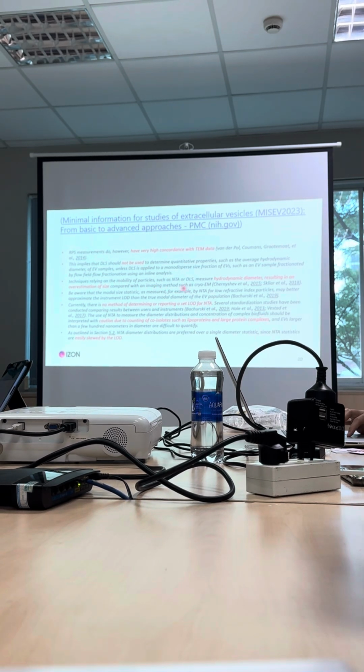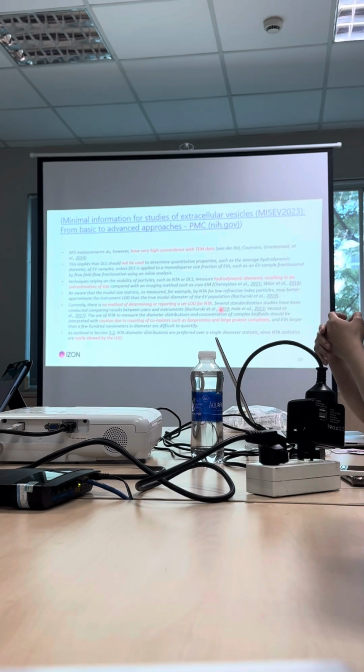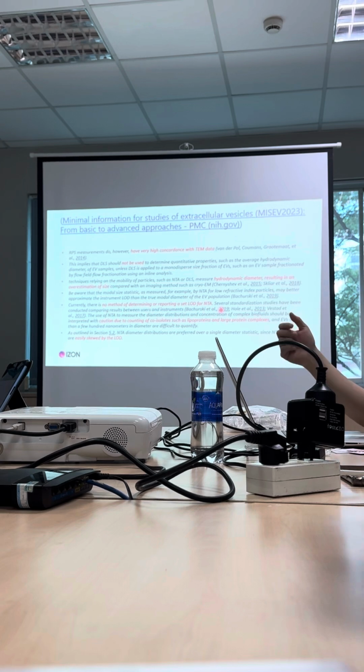Compared with the imaging method and the current imaging data, you see here, they also mention there's no method for reporting the LOD of the NTA, because it's all based on experience values, just like estimates. But if you set a value, each EV particle is different, so you cannot estimate the LOD for every particle. It's not possible. There's no method for doing that.